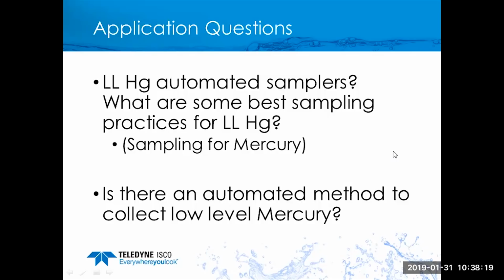Find a location where there is less debris, maybe some natural barrier that would divert debris around the intake strainer. Certainly there can be artificial means of being able to divert debris around. Something as simple as a diversion plate of some sort out in front of the strainer to shed and move debris off to the side so it doesn't collect up on the strainer.